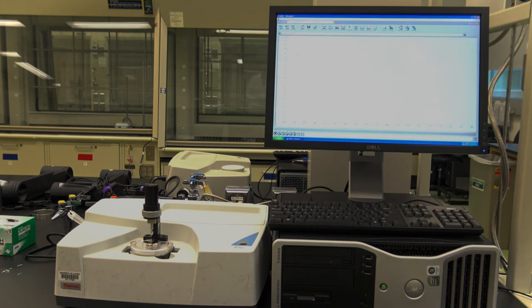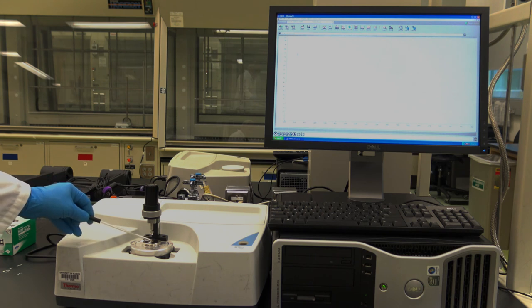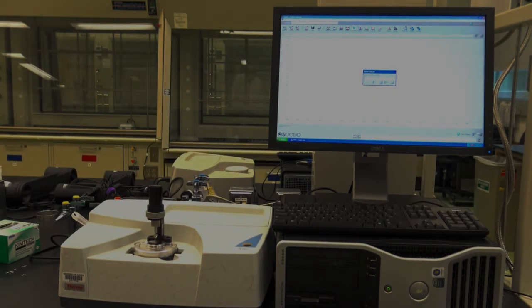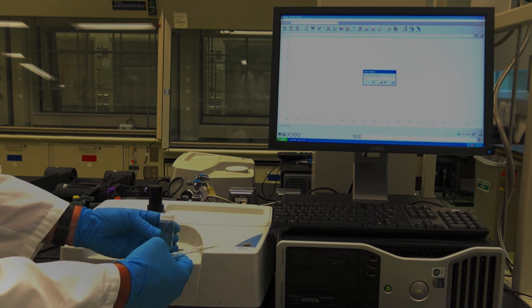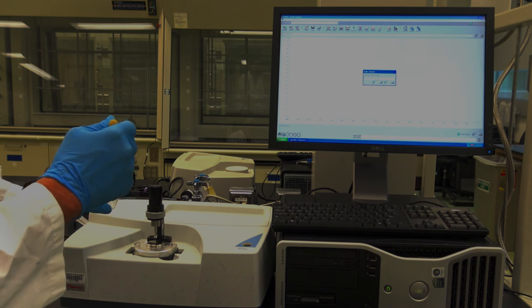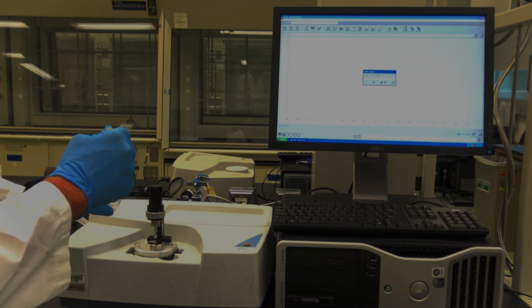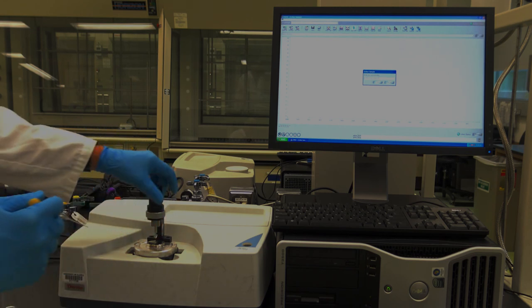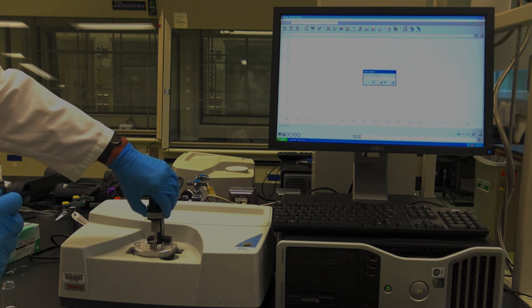Now, we're going to place some of our sample on top of the anvil here, lower down the head, and we'll take an actual spectrum of our essential oils. So now I'm ready to put my sample down on top of my anvil. I have a Pasteur pipette again and my sample. I'm going to open that up. Take a small amount out. That's one advantage of using the ATR system, is I don't need much material. So I can put some right down on the anvil, lower down the head and tighten it.